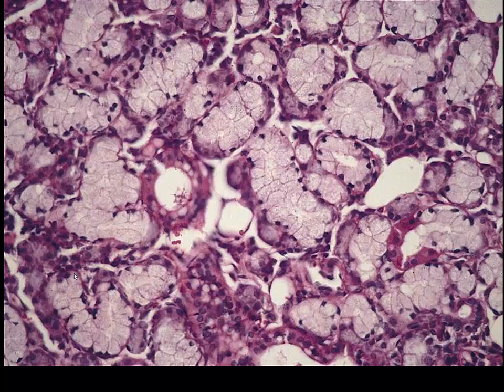Now, this is one of the few sections I could find that exemplifies sublingual gland. Sublingual gland is going to be predominantly mucus type parenchyma. We will have serous demilunes, and we can see some of those on the periphery here. We have a lot of serous cells in this particular area, but predominantly we're looking at a mucus type gland, and that's how we'll distinguish parotid from submandibular from this one, sublingual.